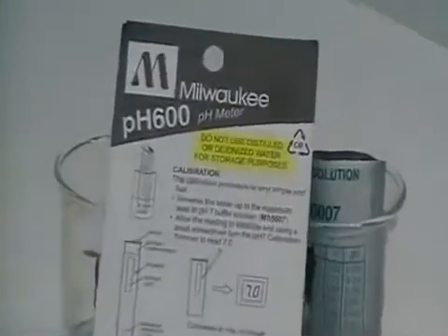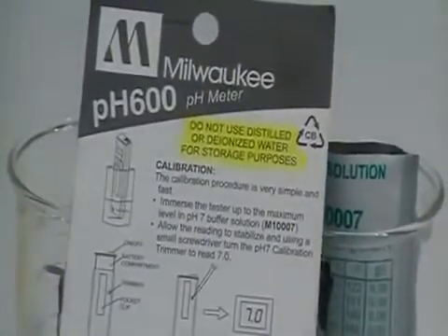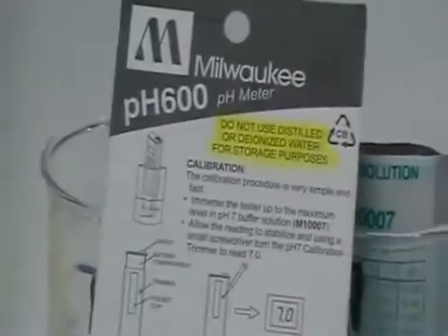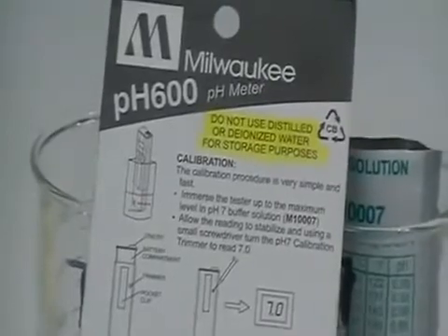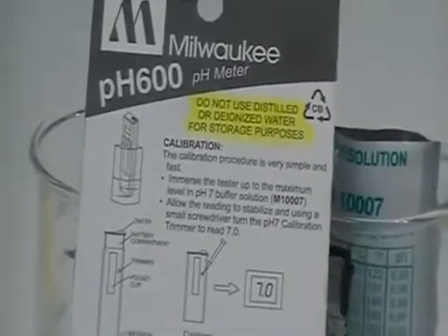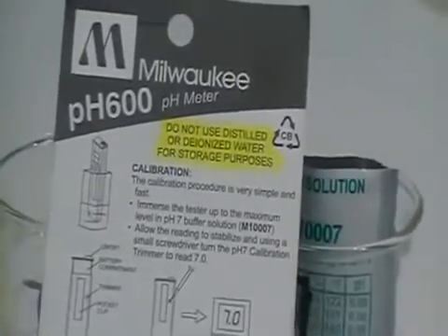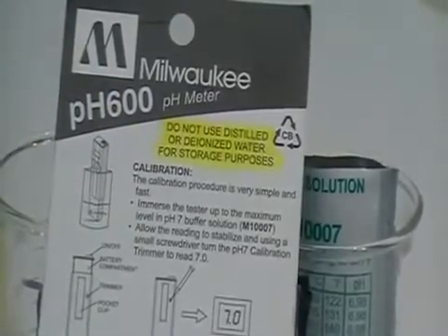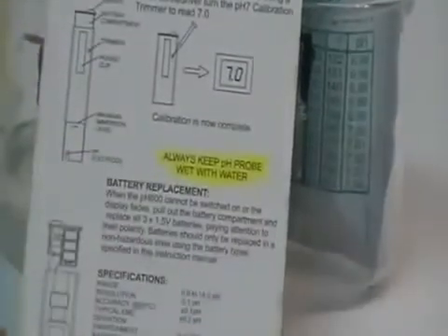We are going to go through the calibration procedure for the PH600 this afternoon. Before we get started, I want to point out a couple of items on the back of the card that comes with the PH600 that you need to pay special attention to. The first one is: never use distilled or deionized water to store your probe. The second is: always keep your probe wet.